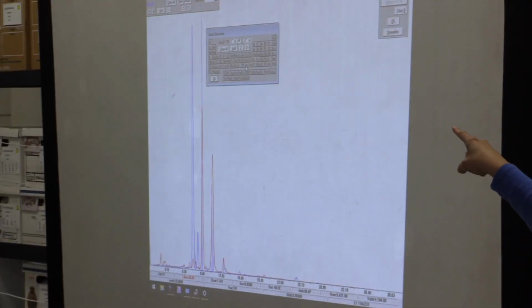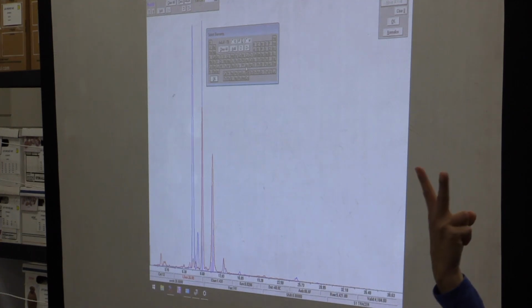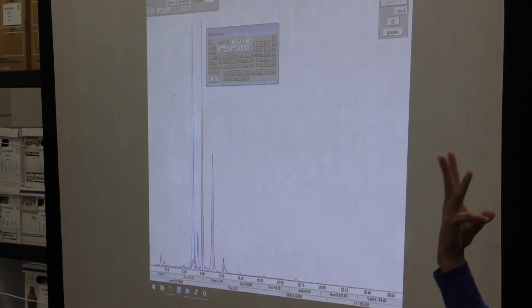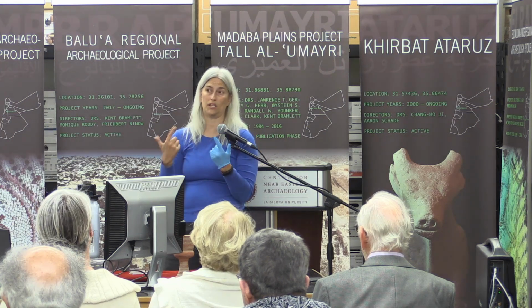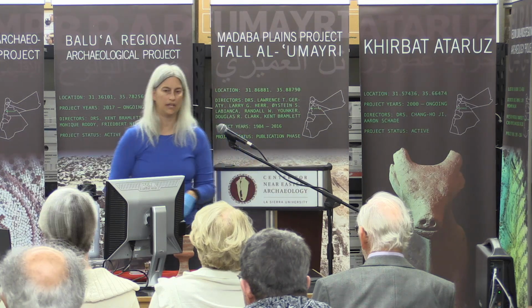I do, however, have gold present. Okay, and so there's a good lineup of that gold on those three peaks. And because I'm looking at a different set of peaks, now instead of just looking for two peaks to confirm what I have present, I'm looking for three peaks to confirm what's present. And so these are mostly gold earrings, totally different metal. Even though when you were describing gold and copper to somebody, you would use the same kinds of descriptors about shiny, copper color, and all that.